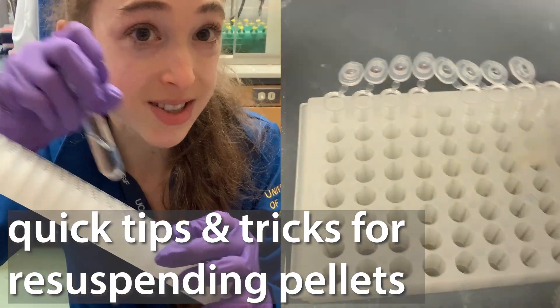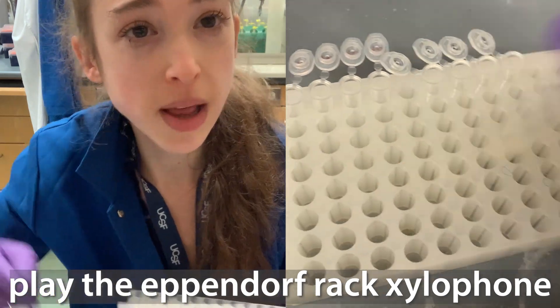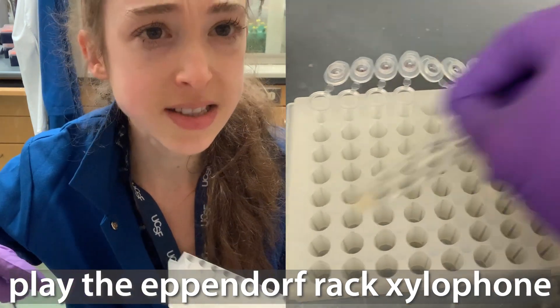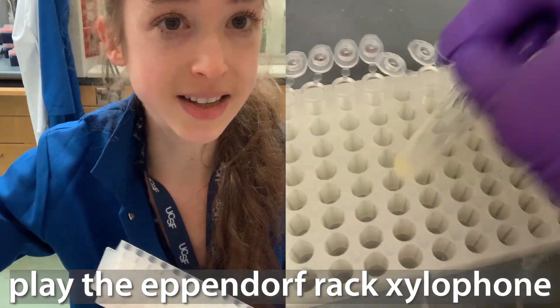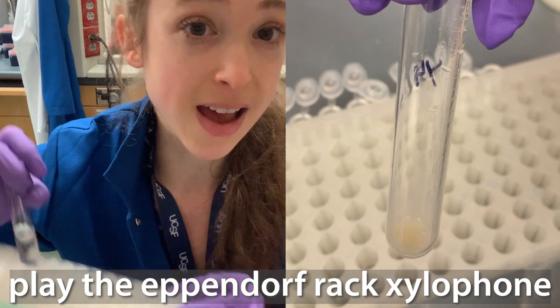Quick lab hack: you can resuspend your pellets on an Eppendorf rack. This is really helpful if you have bacterial cell pellets that you're resuspending as part of a mini prep, if you have precipitated nucleic acids as part of a purification protocol, or various things like this. The sound of the Eppendorf xylophone is common in the lab.